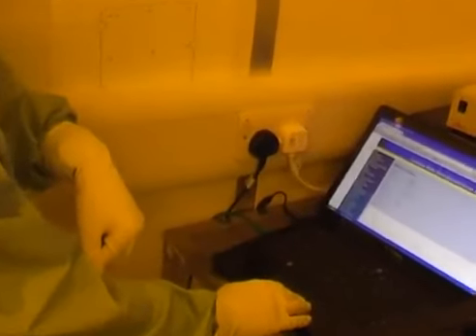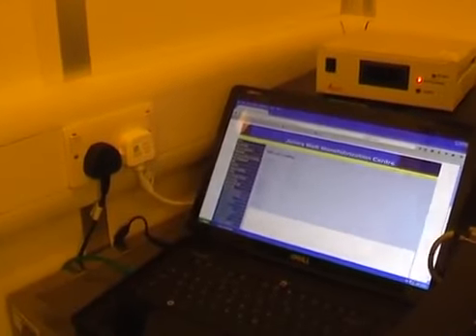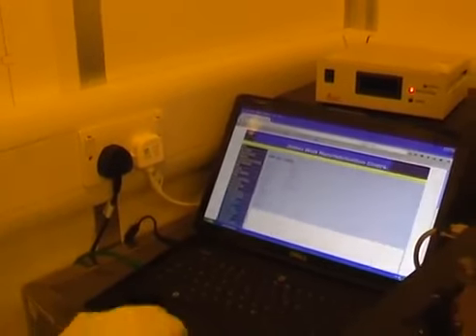Now 800 microns is an unusual thickness. Most wafers are thinner than that. So this of course means that we have to have a special holder dedicated to this sample. The other thing we can see here is registration yes, and that tells me that the sample needs to be aligned and that we need to be very careful as we load it up to get the alignment correct.